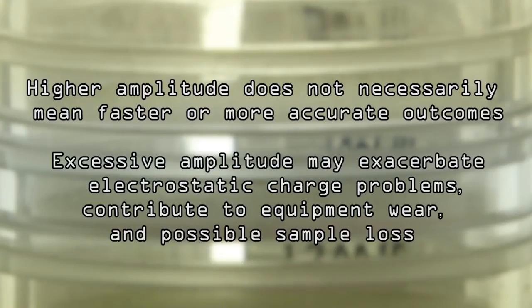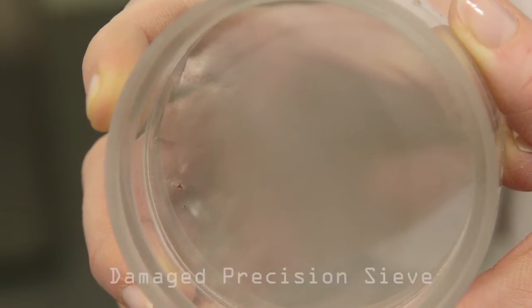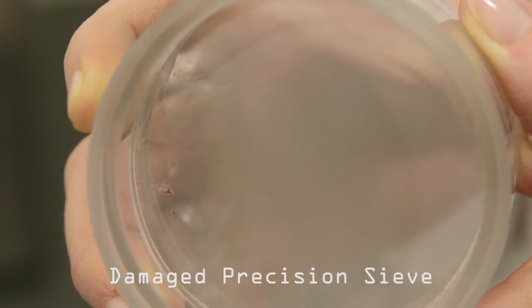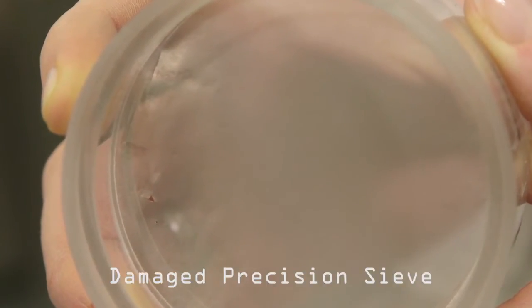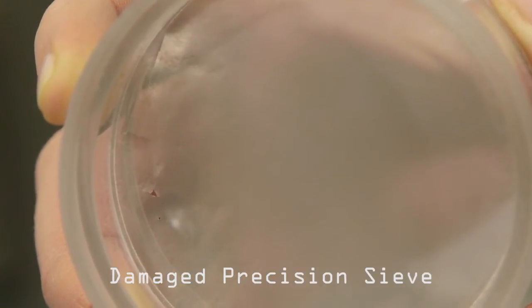It is important to note that higher amplitude does not necessarily mean faster or more accurate outcomes. Excessive amplitude may exacerbate electrostatic charge problems, contribute to equipment wear and possible sample loss. Precision sieves are especially prone to premature or immediate failure if run with excessive sample size, excessive amplitude, or if on an extended test cycle.